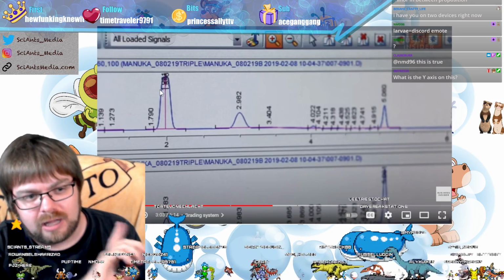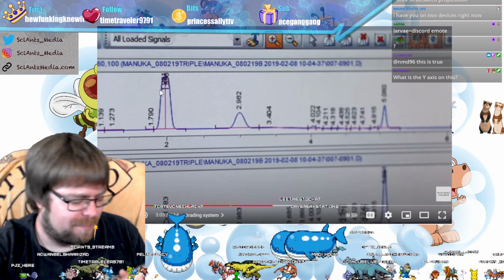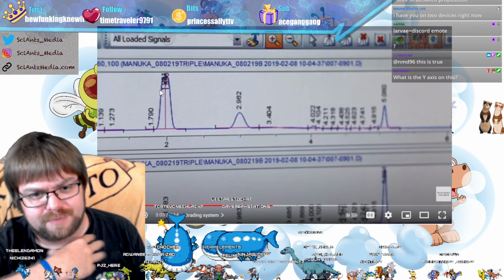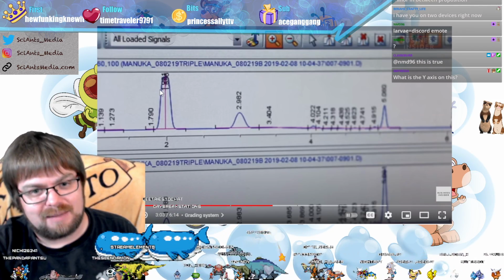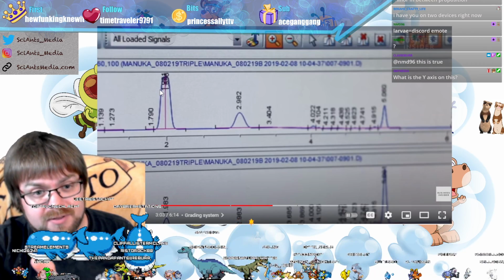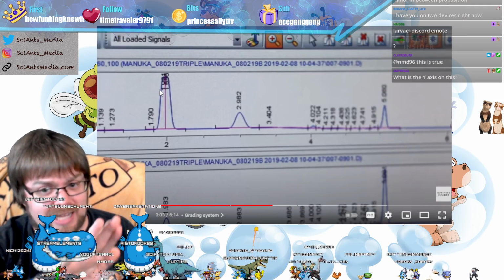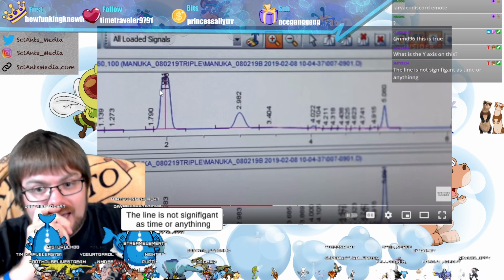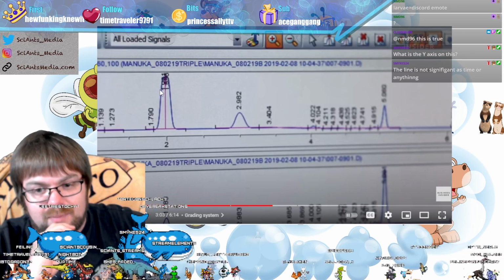These instruments are hilariously sensitive. You're not allowed to wear makeup, or not makeup, perfume around them, because the smell of your perfume will get into the machine, and that'll be analyzed and be put out as data. It pulls out ambient air levels. That's why you always run a blank as well. Here is what the machine is just detecting of just everything just being in the air. The line is not significant as time or anything.